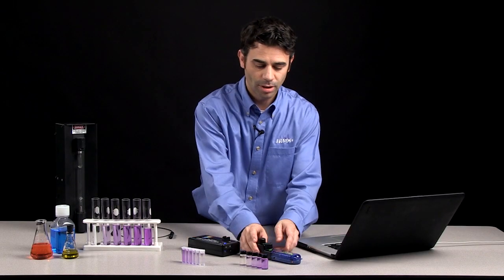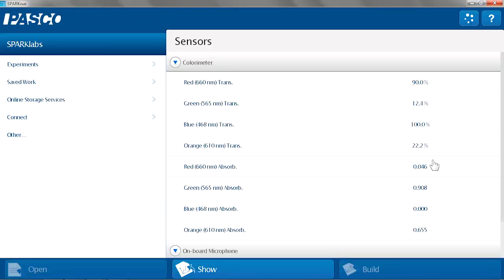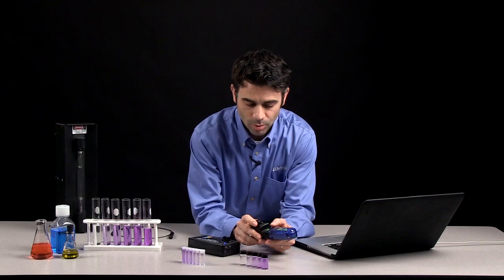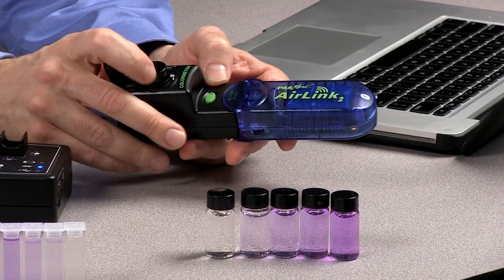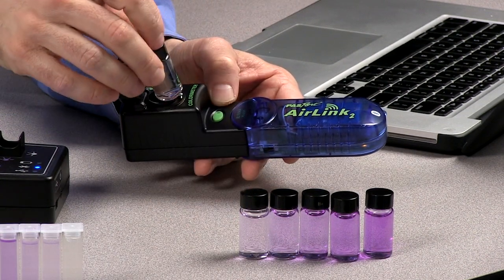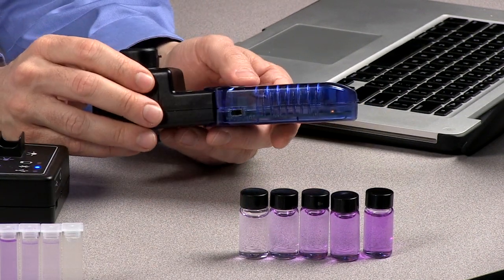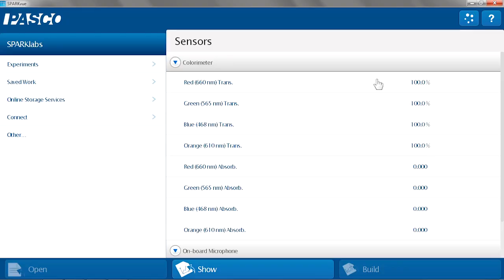So first we'll talk about the colorimeter. I have the colorimeter Bluetooth connected to SparkView, but it also works with Capstone. One of the great features of the colorimeter is that it's a quick one-button calibration. So I simply put in my blank, push the button, and allow it to calibrate so that I get 100% transmittance and zero absorbance for the four LEDs that are present.